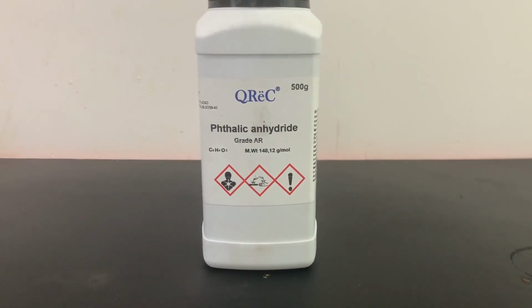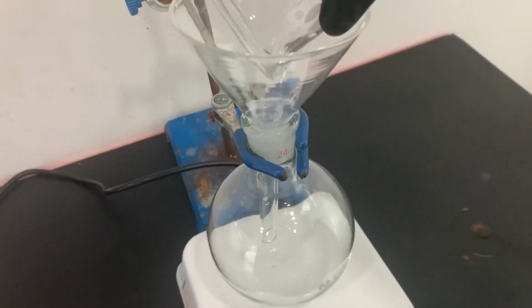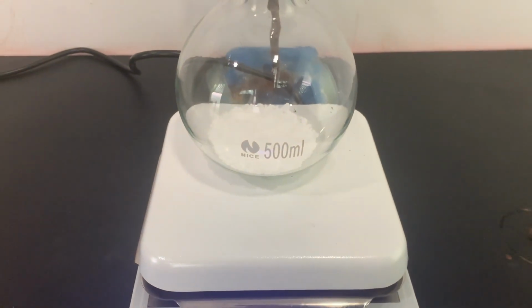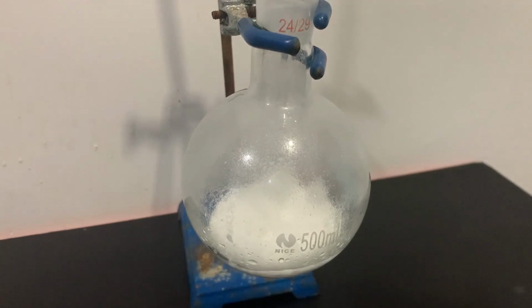To make the phthalimide, I used 20 grams of phthalic anhydride and 4 grams of urea. I then added both of these into a flask. I turned on the hot plate and heated the flask until the reaction is complete. The reaction is done when the contents of the flask puff up.